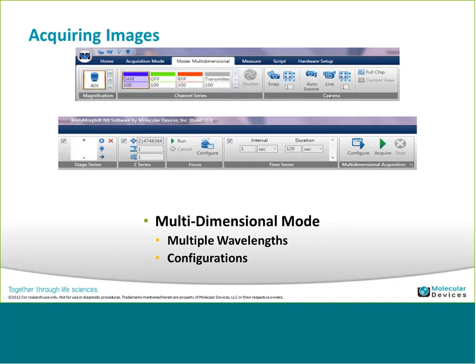So for the stage series, you would click on this is a stage map, so it shows you a reference of one stage position to another. You can see the relationship as you acquire, because it draws a connection between them. So you can create your stage positions to be a little more efficient for your stage moves by the map that's there.